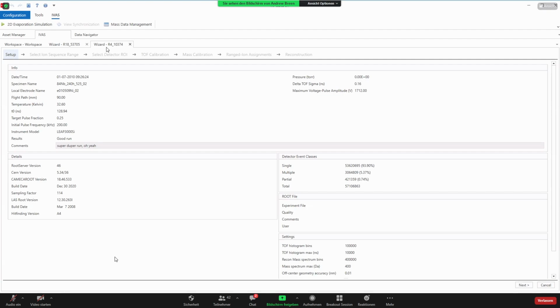The first one that we'll look at is just a pure aluminium data set. Maybe not so interesting from a material science perspective, but we still use technically pure aluminium a lot. This is a sort of archetype example to develop a lot of our crystallographic analysis and reconstruction protocols. So we'll start with that, and we get a lot of crystallographic information, so it's a good one.